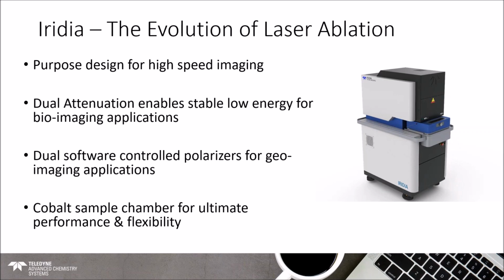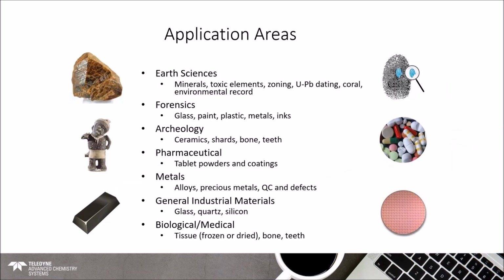And then where I want to finish up is talking a little bit about applications. You know, we've already talked about what can be used. I think this does a nice way of putting them into the markets in which they apply. Earth sciences, as I mentioned, is a really big one for us. I spend a lot of time in geology labs or geochemistry labs. Forensics is another. We showed that ink on paper before, which is very neat.